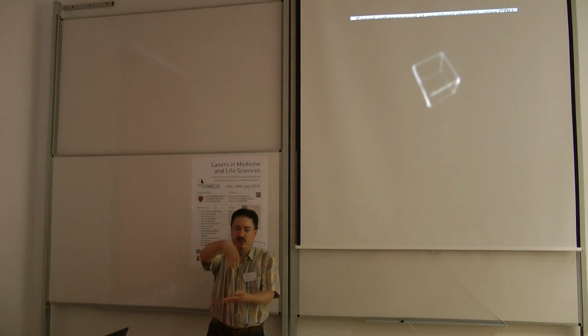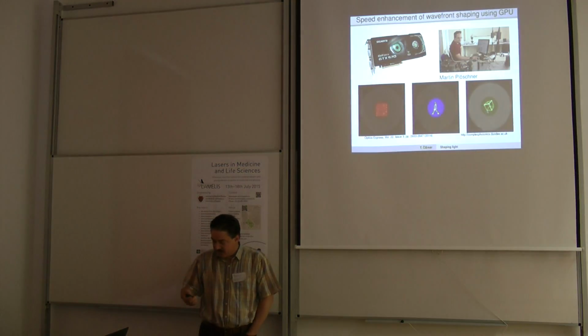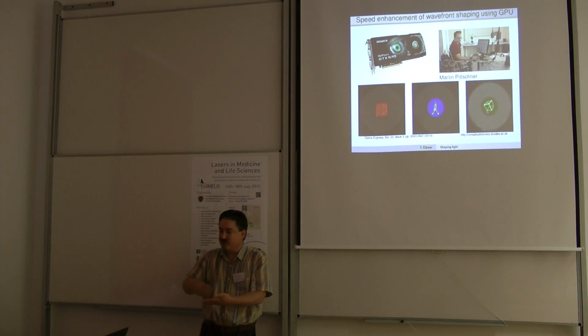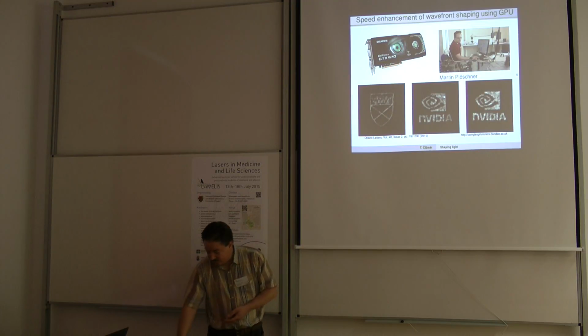Basically, we've really quickly illuminated the SLM under different angles, and essentially each of these images is constructed by points that are not appearing simultaneously. There's only one at a time. But after continuing the research, we could actually eliminate this limitation, so we don't need any AOD anymore, and we can combine quite a few points.